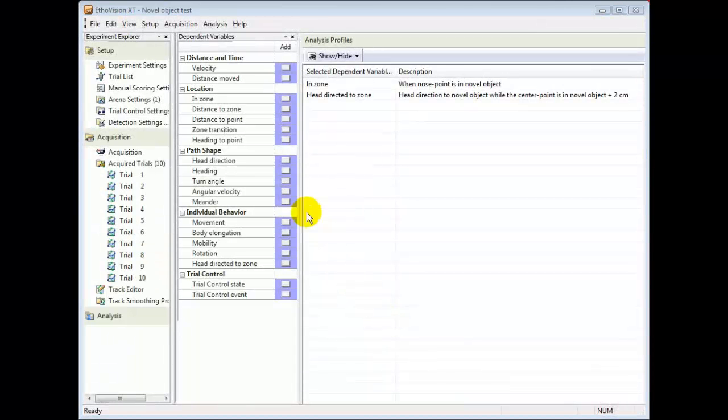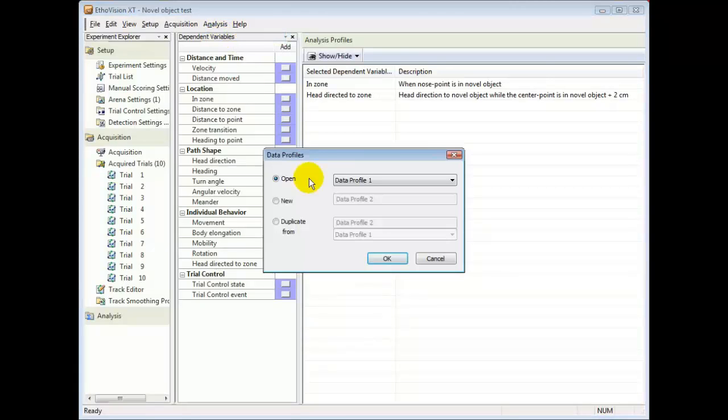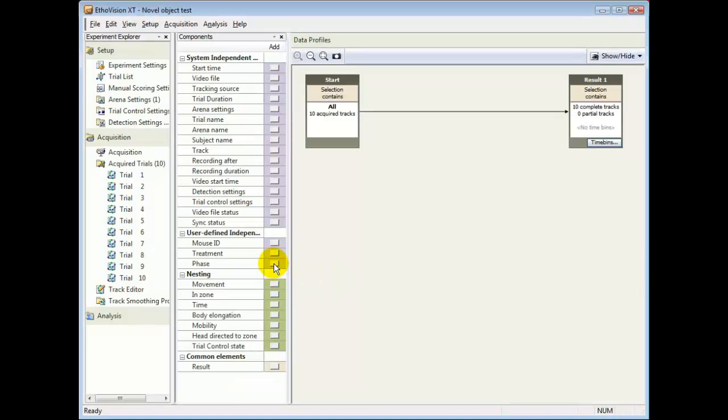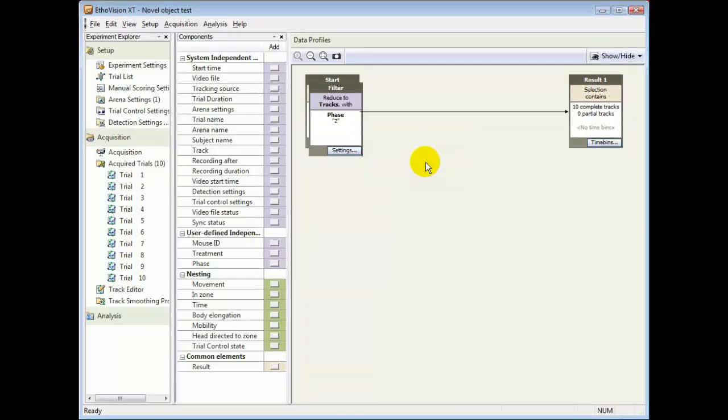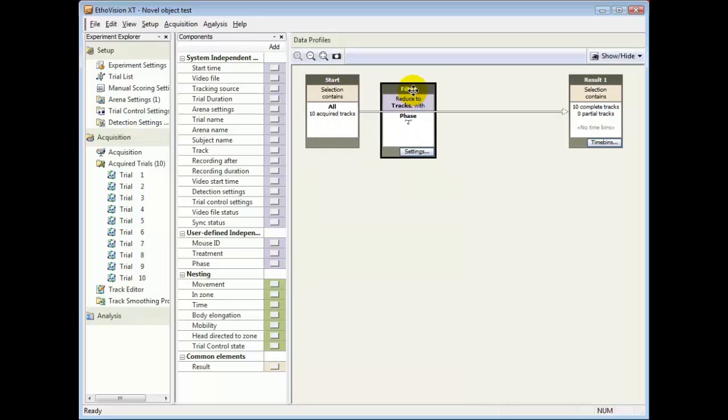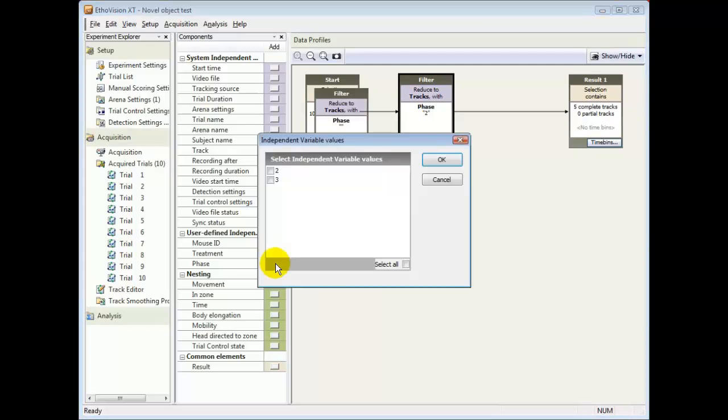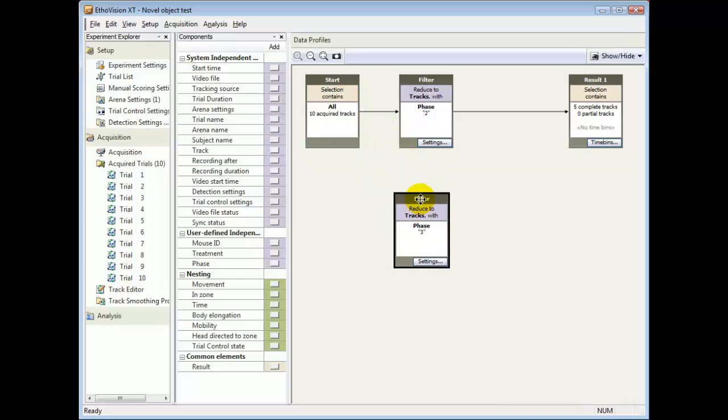You can make a data profile to select only some of your data. Here I create a filter to select trials of phase 2, where the mouse is confronted with objects for the first time. I then do the same for trials of phase 3, where the mouse is confronted with one familiar and one novel object.